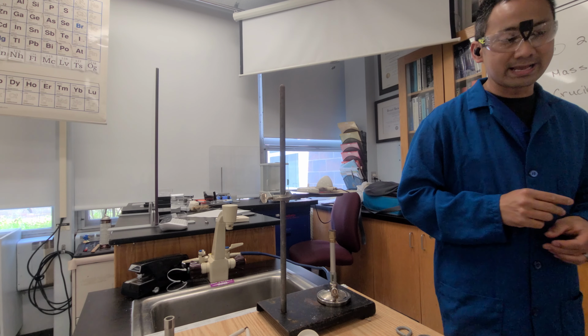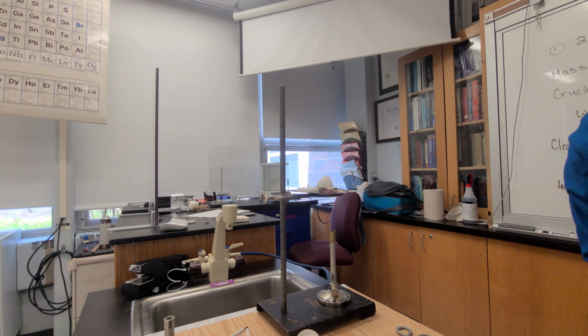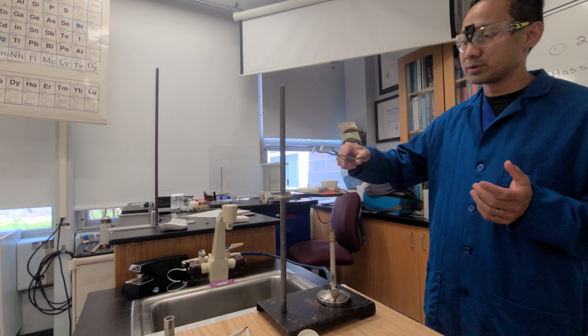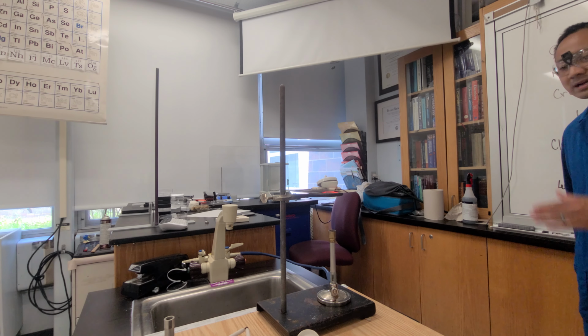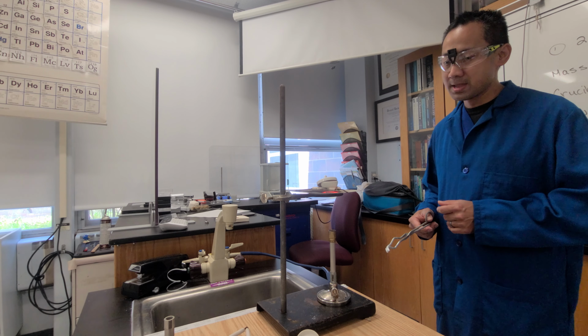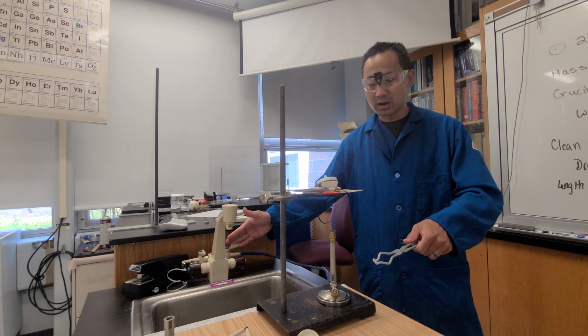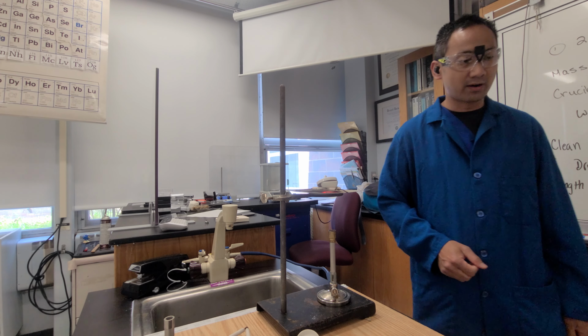Okay. So what we're doing right now is just heating this up. And it's relatively new. It's telling me to put it on for 5 minutes. I am not going to be doing that. It says partially open, right? I am not going to be doing that. We're trying to dry these off. So technically that is the standard for this. Most people are going to say this is way too hot. I like this. It works for me, okay? I could turn it down slightly. I tend to always adjust not from here, but at the Bunsen burner itself. This needs to be full on, and I'm going to rely on the needle valve on the Bunsen burner.